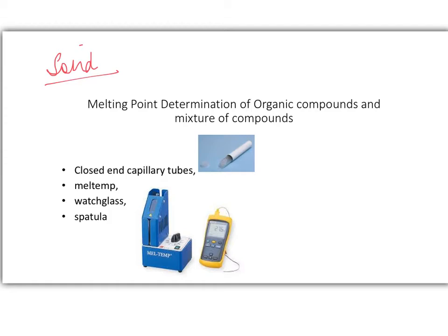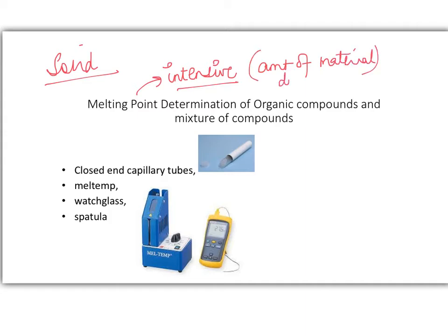Recall from your previous chemistry experience, melting is a phase change from solid to liquid. And so, what you're measuring for melting point as a property is not going to change whether you have 1 kilogram of material or 1 milligram of the material. So, that means that melting point is an intensive property and it does not depend on the amount of material taken. Amount of material does not control the melting point. So keep that in mind.